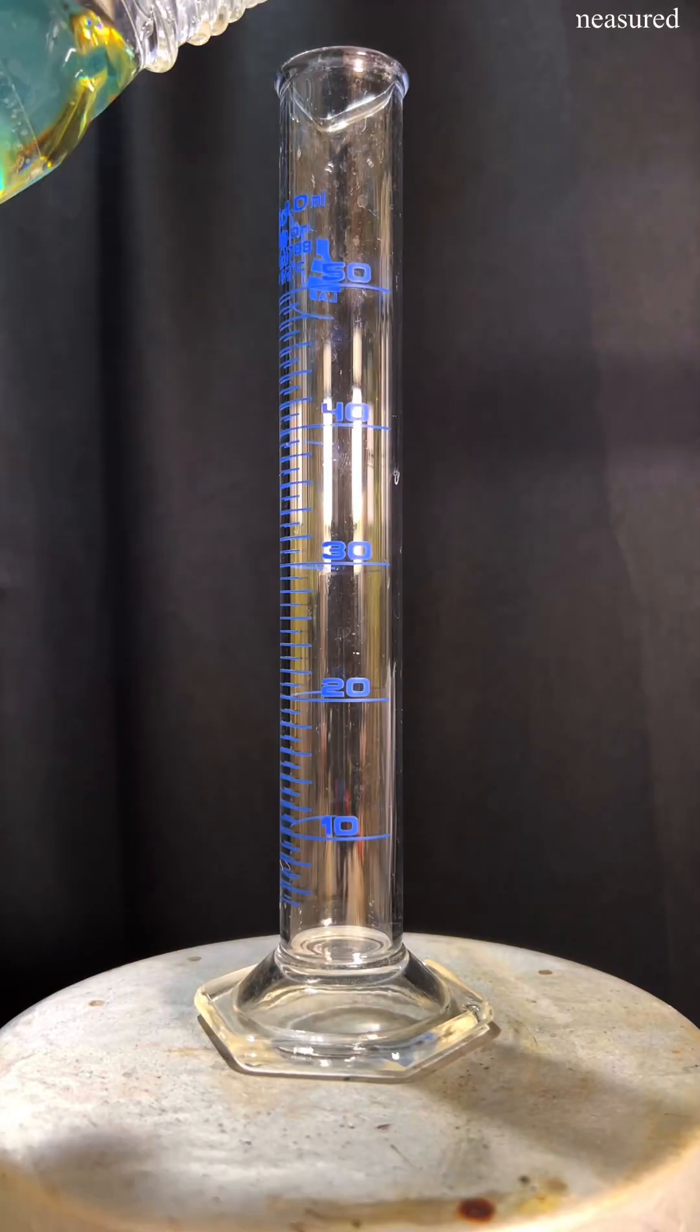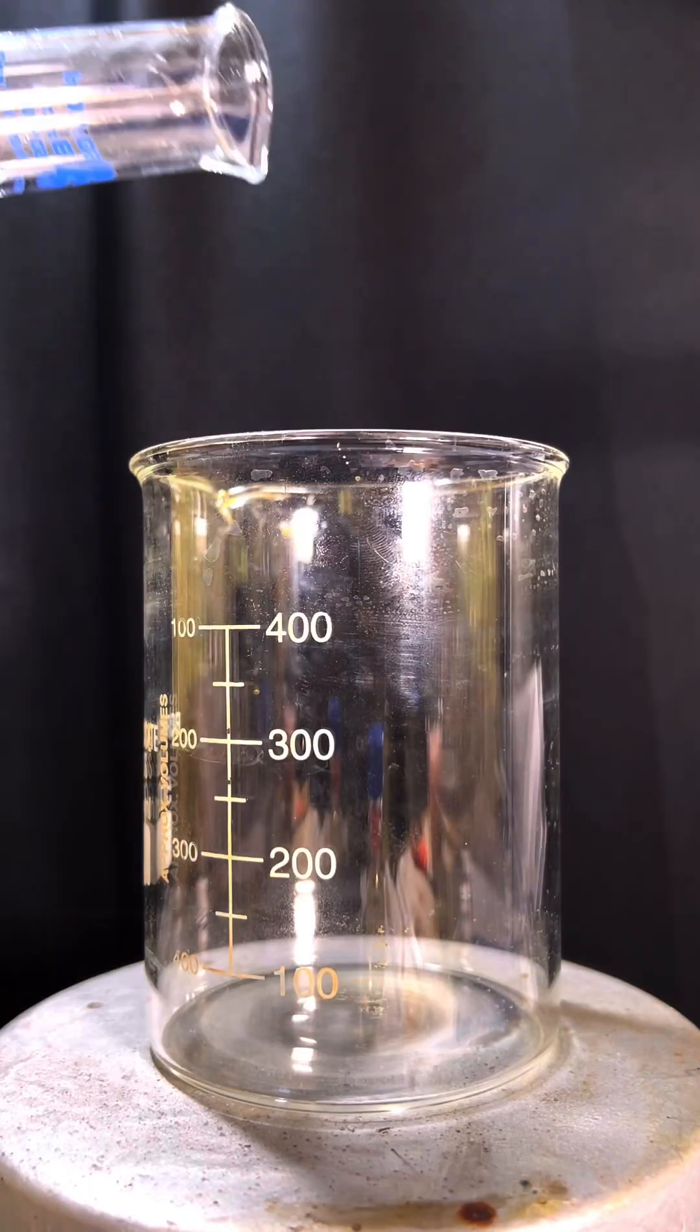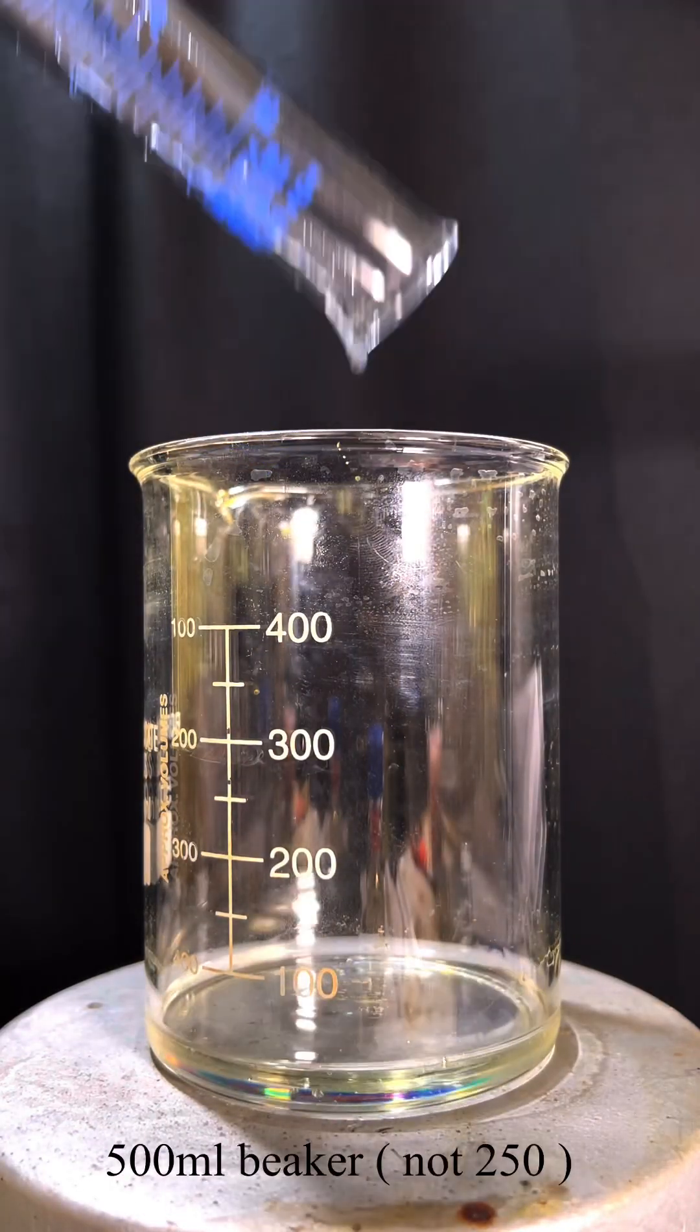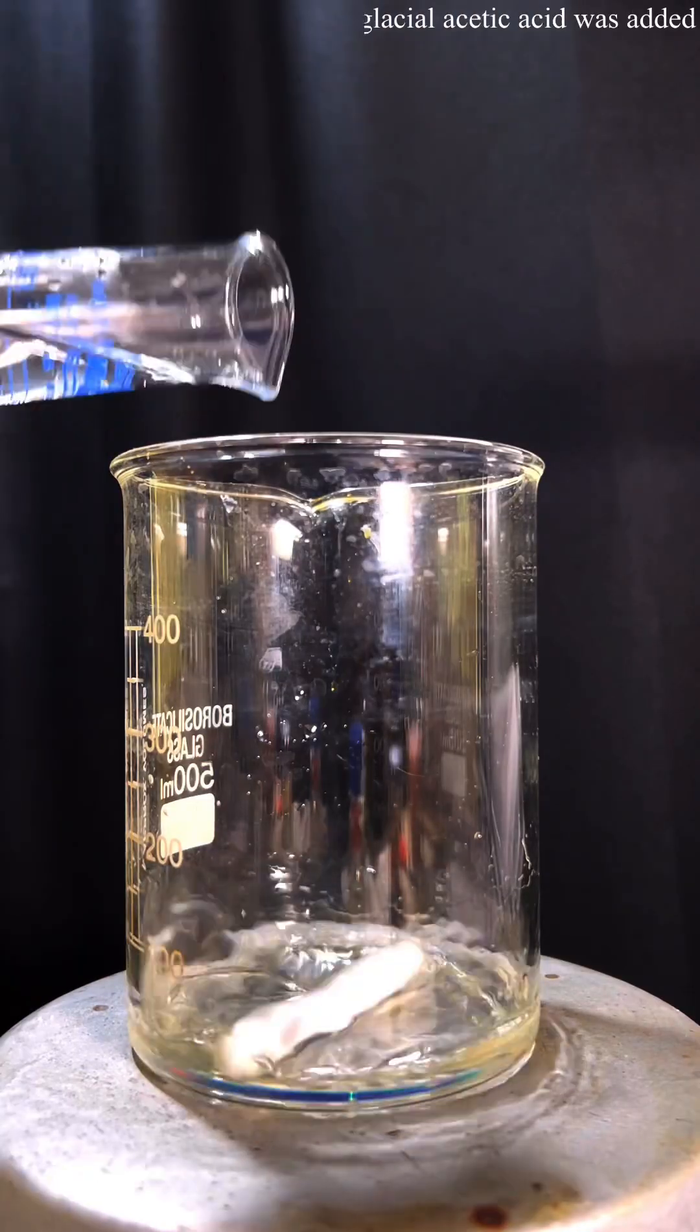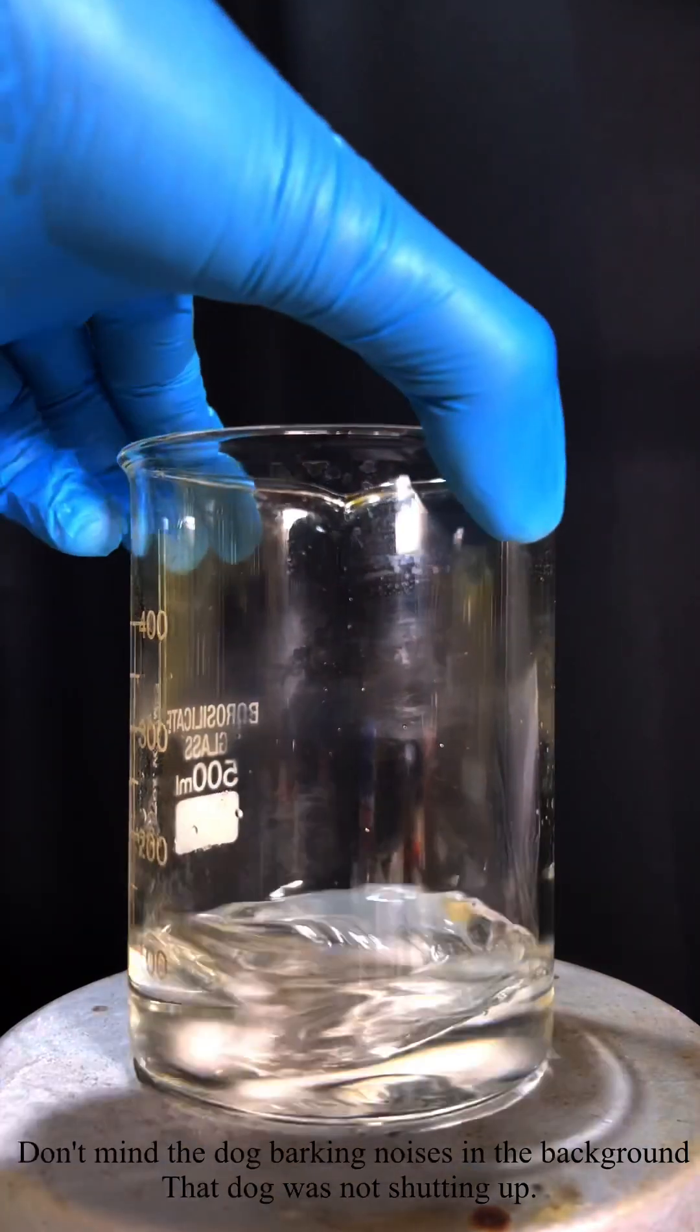For the synthesis of tri-bromoaniline, 15 ml of aniline was measured out in a graduated cylinder and transferred to a 250 ml beaker. With the stirring turned on, 50 ml of glacial acetic acid was added to aniline.